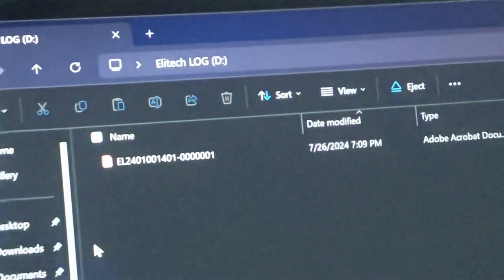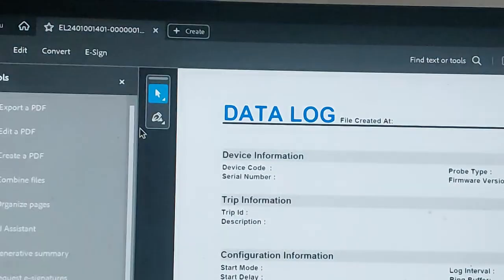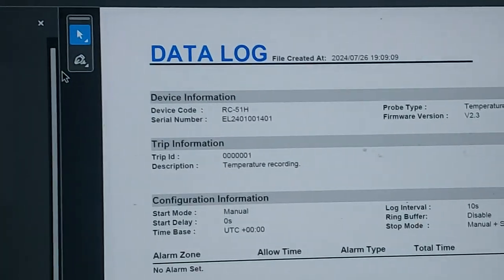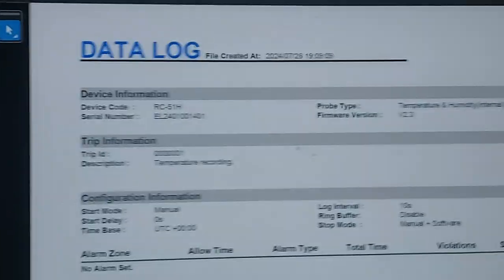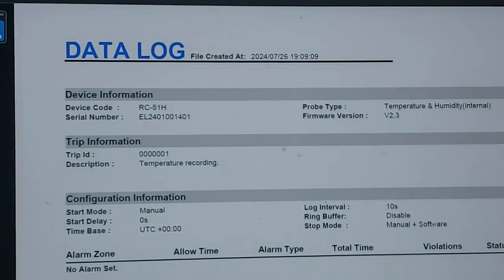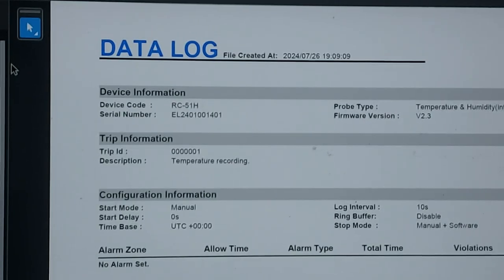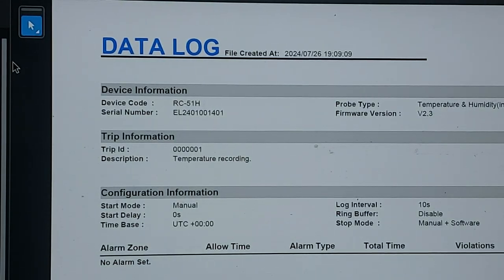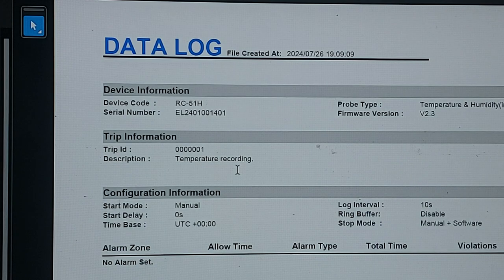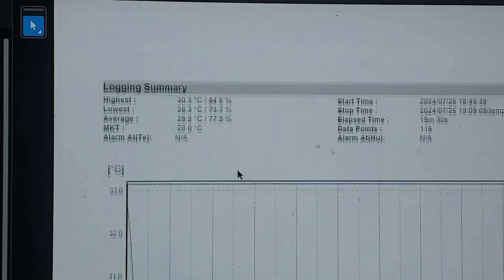Automatically, a PDF document of the data log is generated. This data log contains the temperature and relative humidity recorded by the logger. You do not need any additional software for this.